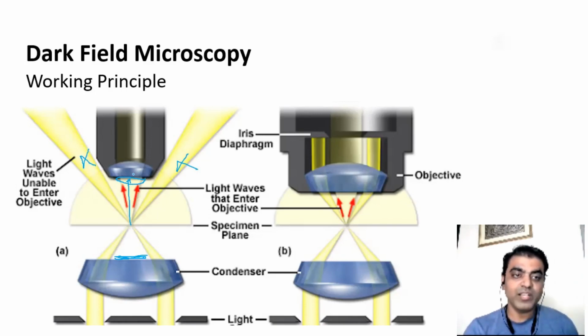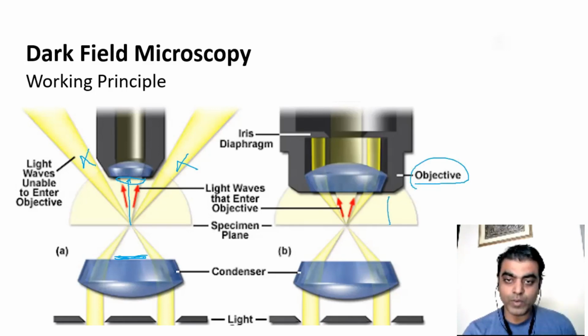If we decrease this length, then there is a chance this light is also being collected, and that is why we see a different type of objective here, which is specially designed for low or small working distance. We say this is WD, the working distance. Basically, in other terms, that is the focal length. So this is the sample, and this is the objective. The focal length of this particular objective is the working distance. Now you see the light is again collected from the center.